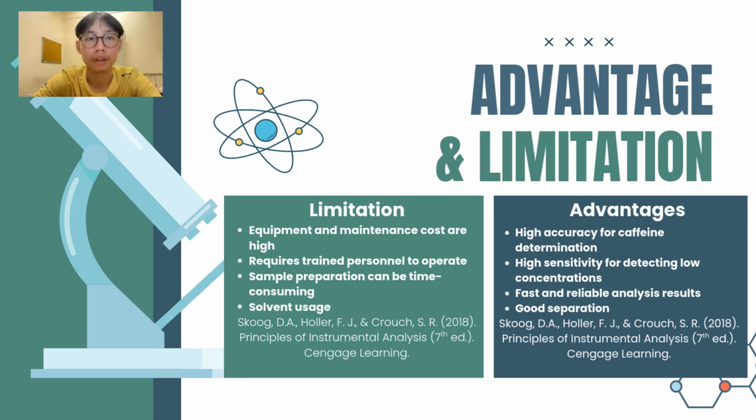Assalamualaikum and hello, my name is Faik Haziq. Next, I will explain the advantages and limitations of HPLC analysis for caffeine determination.